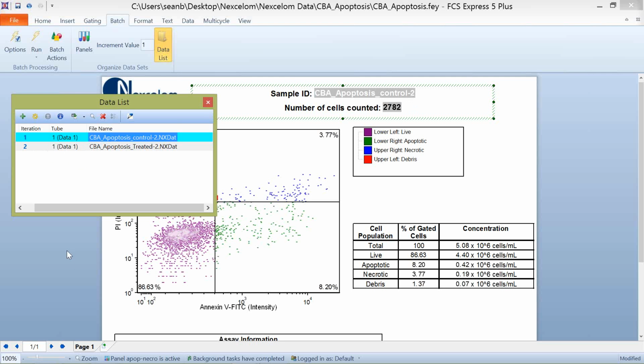I have one more question. So we can link the quadrant gates, as we talked about previously, and in this version, can we link the linear markers, or still no? We cannot link the linear markers. No. Okay. All right. So this is still okay. Yeah, it's still high up on my list of pushing to get that done through the developers. Okay, so it's not yet. It's in the pipeline, yes. Okay, all right, no problem. Just wanted to make sure.